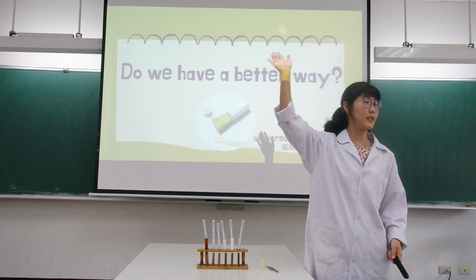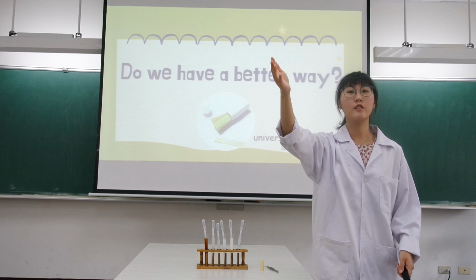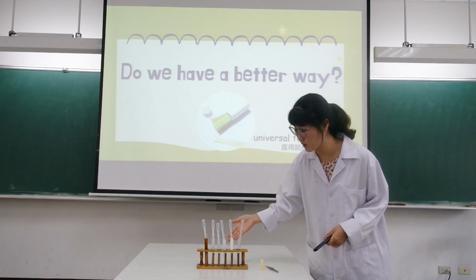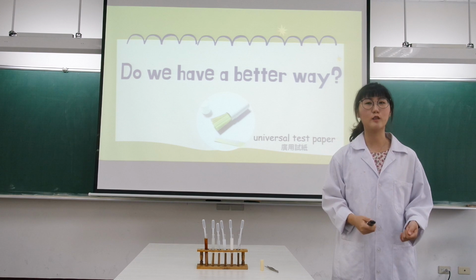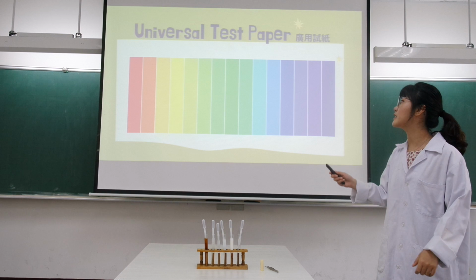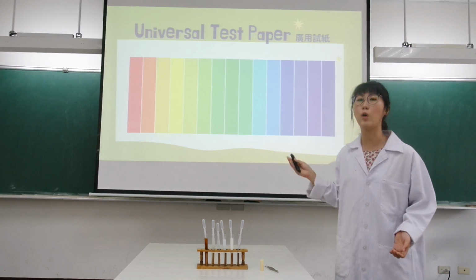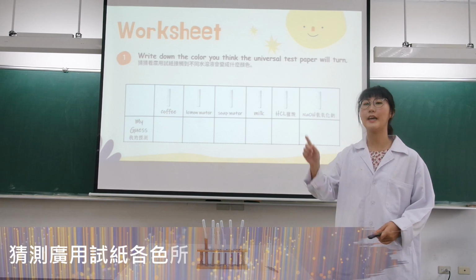Can anyone tell me? Okay, group 2. Oh, you think the color will change? Very good. When we use the universal test paper to test a solution, it does change color. That's a very, very good answer. You answered very well, you all know what will happen. So these are the colors the universal test paper might turn to.